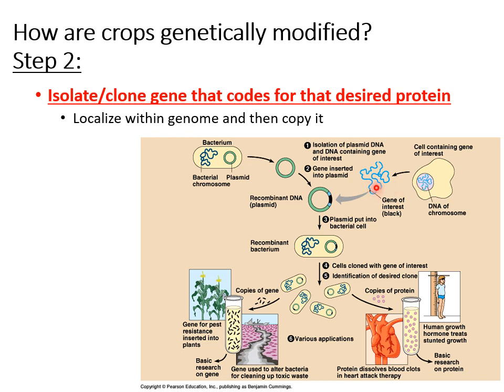You cut that particular gene out, put it in a plasmid, and get bacteria to make a ton of it for you. And then you can use those copies of that gene toward the next steps of your genetic modification process.